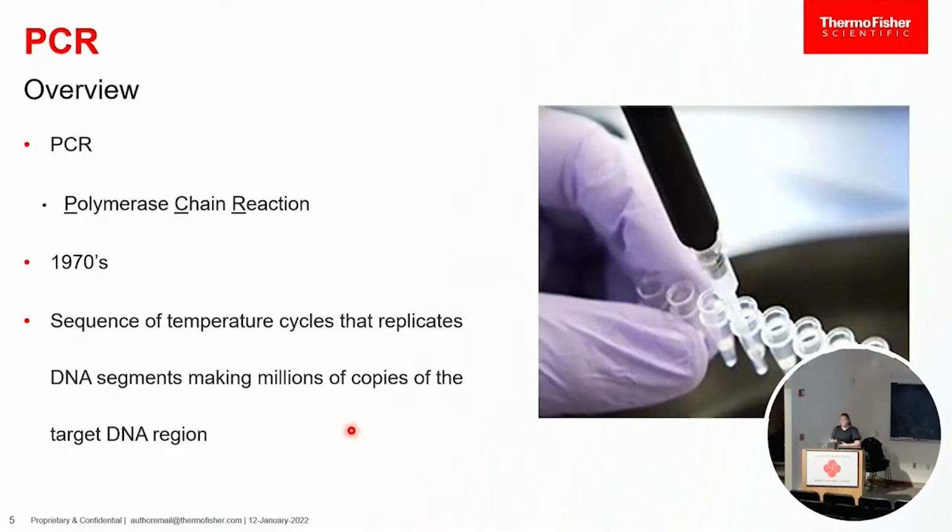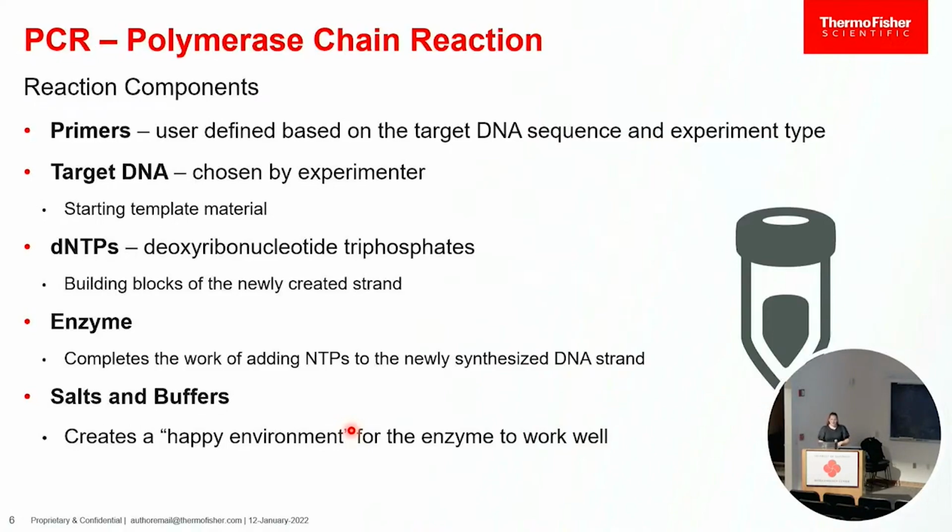We can make millions and millions of copies of this target region and do our investigations. We can send it for sequencing, we can measure how much we made, and we can do a lot of things that way. What are the reaction components of PCR?